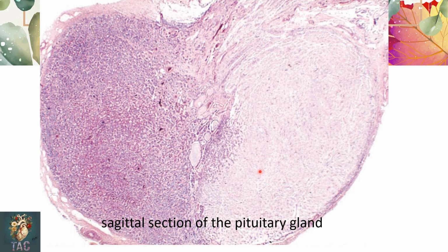Histologically, pars nervosa is formed from the downward growth of the floor of the third ventricle, and it contains the axons and the axonal terminals over here. And the only cell type present in pars nervosa is the pituicyte, which is irregular in shape, having many cytoplasmic processes, and is considered one of the types of glial cells.